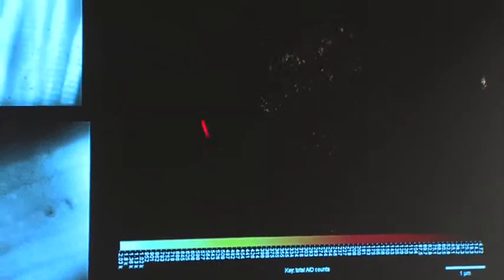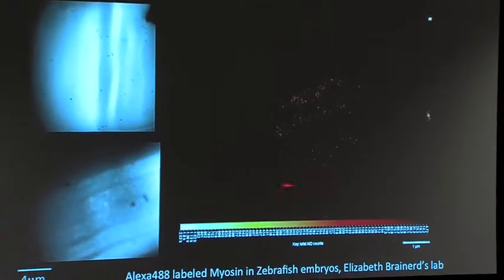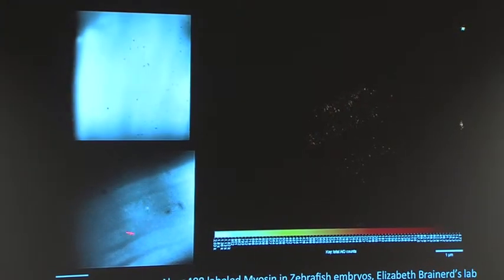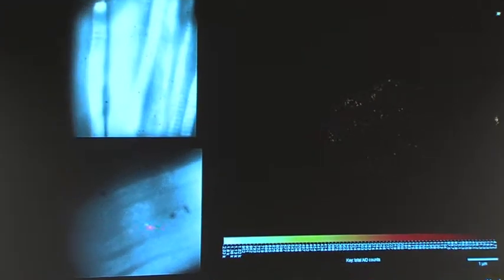So far the images I've shown have been mostly in thin samples, maybe 1 micron thick or so. Here we've also done some imaging in zebrafish embryos, and we've been able to show that using Alexa dye you can look at the blinking of individual dots here. Again, you can see there's a lot of background, and the spots aren't as sharp as they are for thin samples, which is why we're working on quantum dots and adaptive optics for this technique.